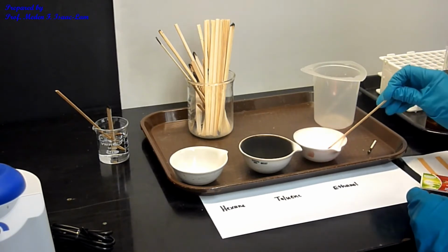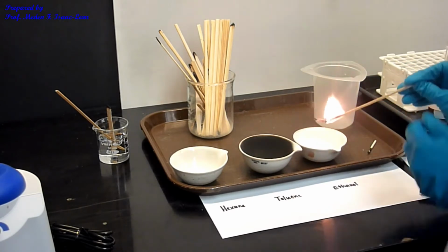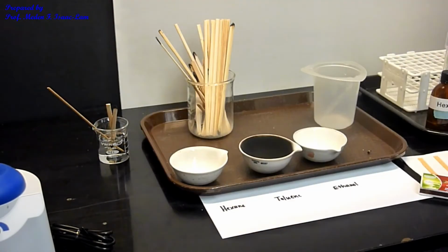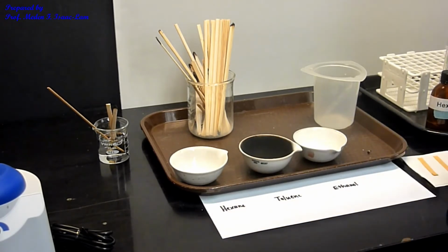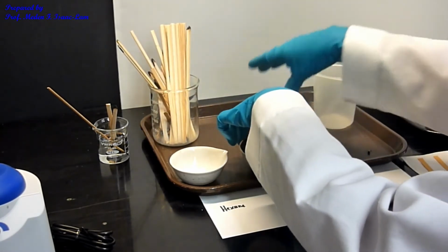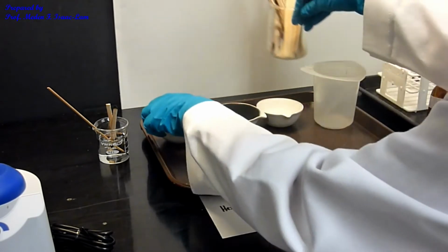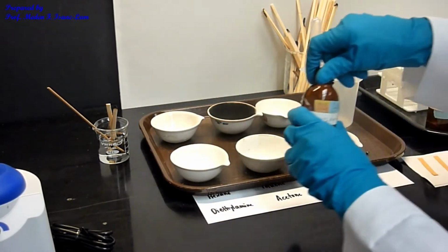So it's clean, it's not dirty. Okay? It's not as combustible as the other two. Okay, so now we're done with those. So I'm gonna put it out here. All right. So diethylamine, again 8 drops.